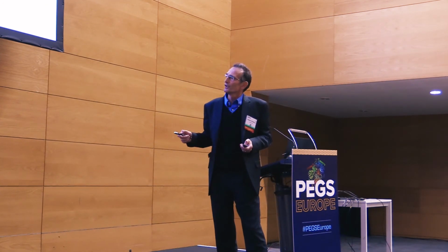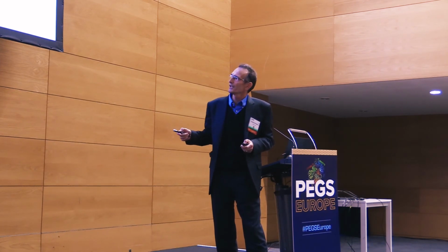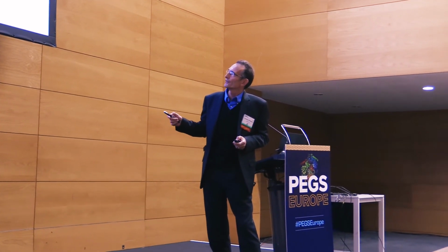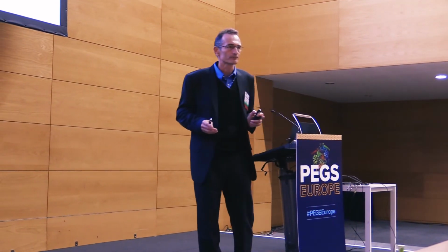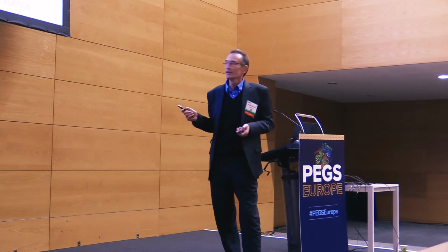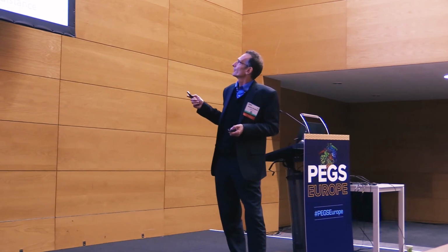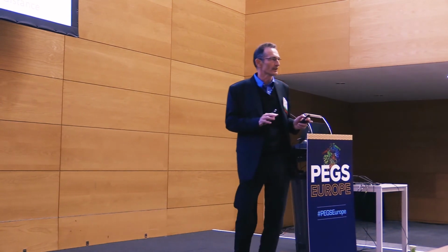If you look at these clusters, this is now analyzed using PacBio. This is a heavy chain cluster here. These are light chain clusters here. You can see the 5 libraries outlined here. And what you'll see is that there are many different clusters. So you may say, well, OK, how different are these clusters one from another? If you look just at the heavy chain CDR3, the average difference comparing every single antibody in these clusters to every other antibody is about 10 to 11 amino acids. These are very different in the HCDR3.